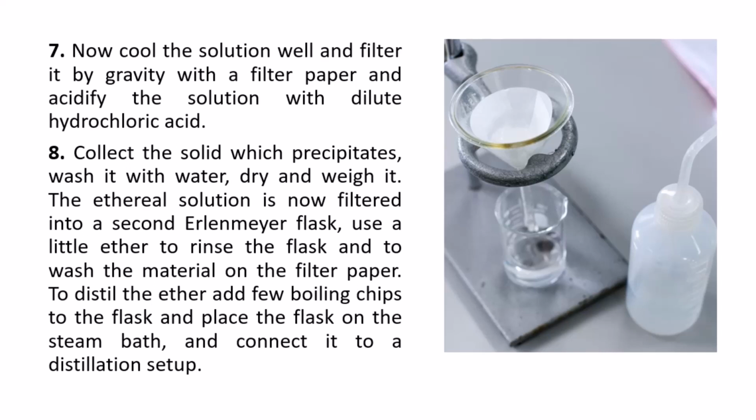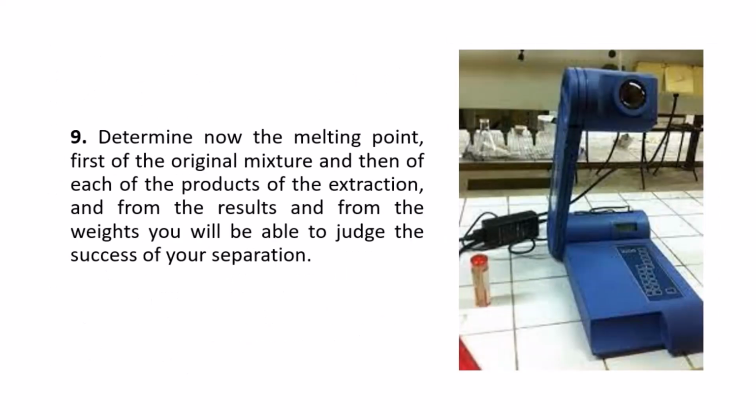Afterwards, you can continue by simple distillation, using the simple distillation setup to get most of the content out to get your organic layer. Then you can concentrate that layer as well, and allow the content to dry.